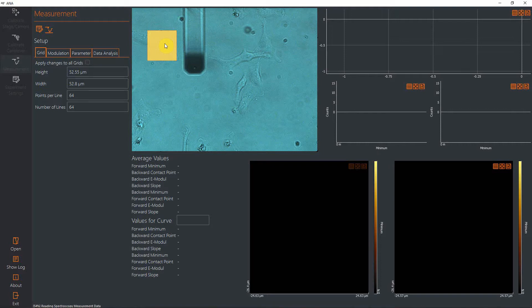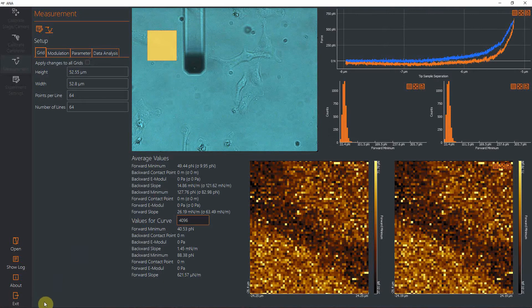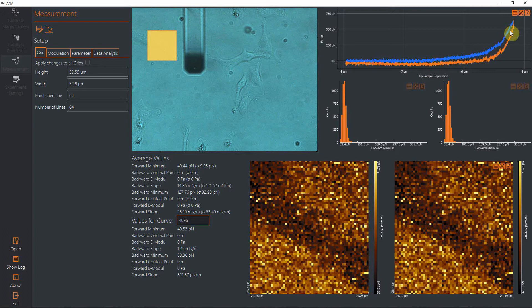To access the data, you simply click on those squares. You can click on one square at a time to load the data of this area. Down here you see the progress.